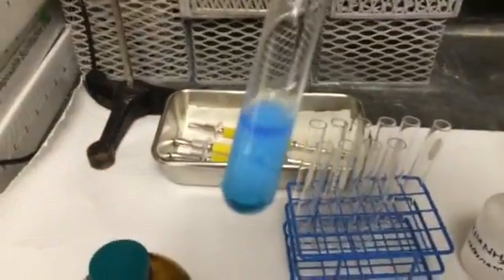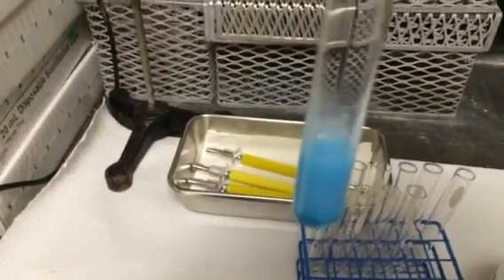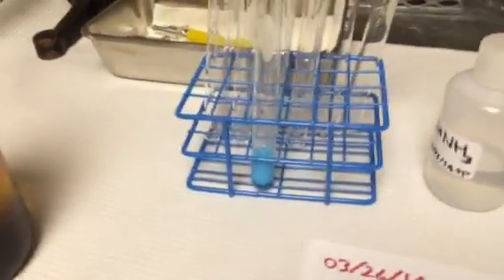Whoa, look at that! Let me check a little bit. Let's let it sit for a while, and I'm going to come back to that one.